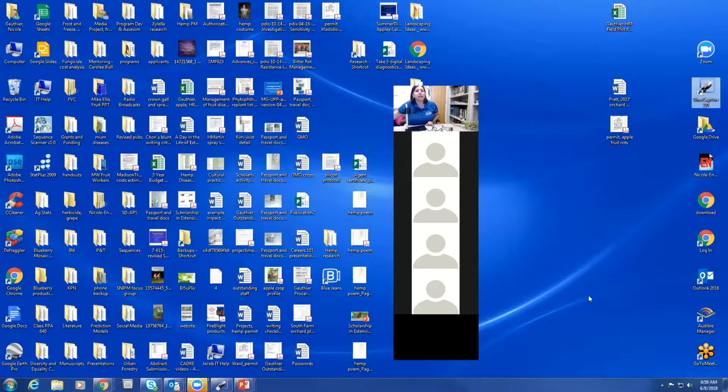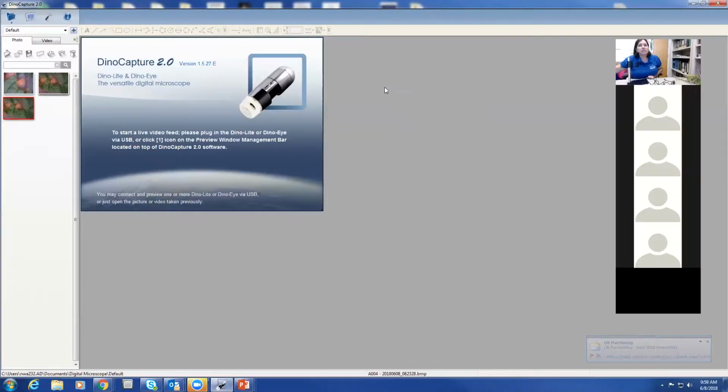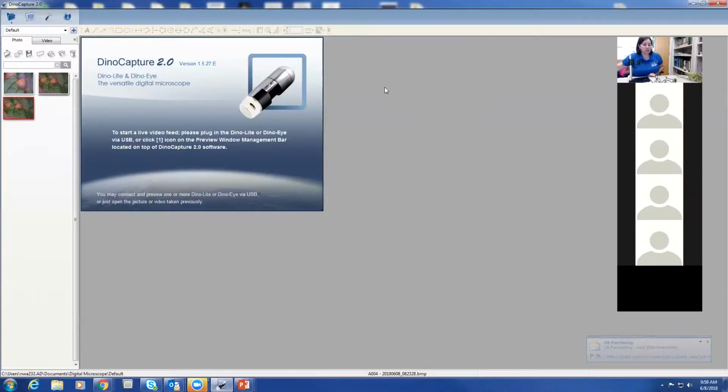Let me try again. Is it opening on the other screen? I've got two screens, so I'm sharing just one. Oh, it's already open. Sorry, guys. All right. So you are now seeing my DinoLite software. This is what it looks like.